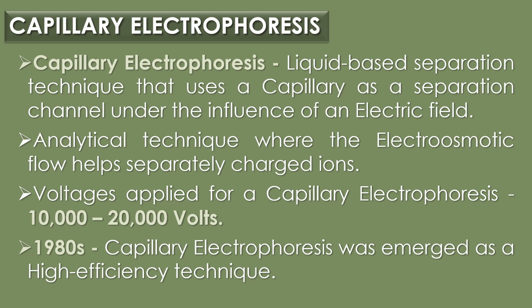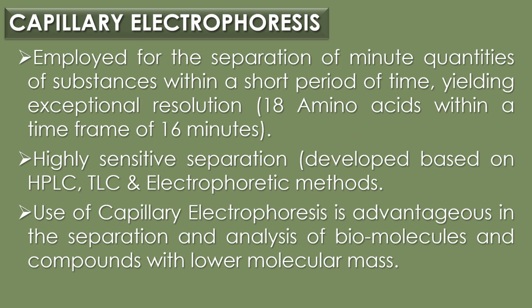In the 1980s, capillary electrophoresis emerged as a high efficiency technique with applications in various fields. The technique is employed for the separation of minute quantities of substances within a short period of time, yielding exceptional resolution. Using this methodology, it is possible to effectively separate a total of 18 amino acids within a time frame of 16 minutes.